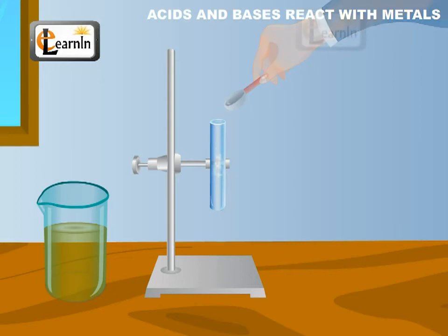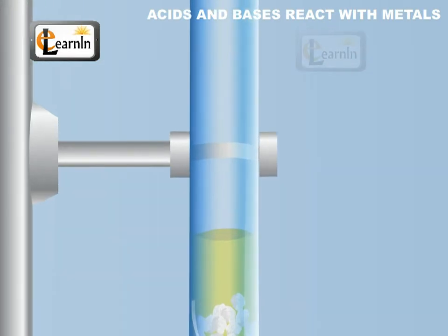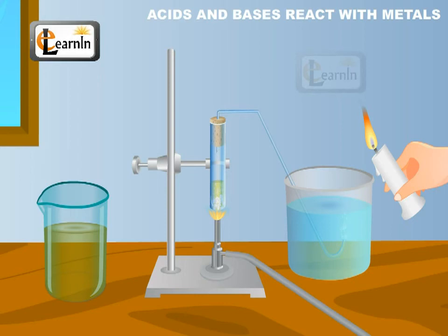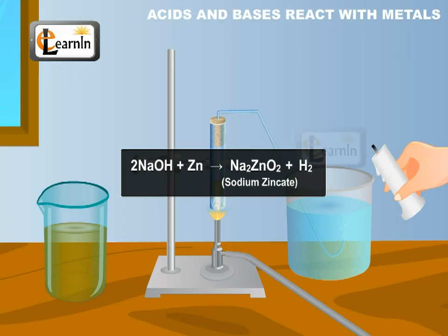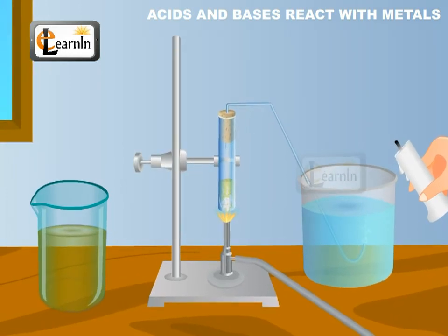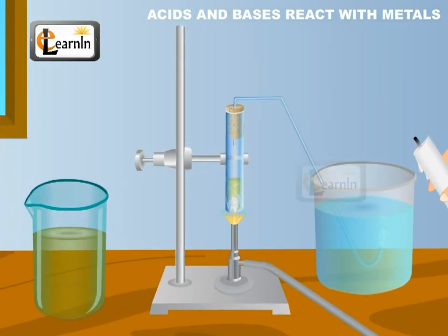Now let's perform another activity. Place a few granules of the same metal in a test tube, add around two milliliters of sodium hydroxide solution, and warm the contents of the test tube. Repeat the same observation steps. The reaction that takes place is: sodium hydroxide plus zinc equals sodium zincate plus hydrogen, or 2NaOH + Zn = Na2ZnO2 + H2. As before, hydrogen is found in the reaction.